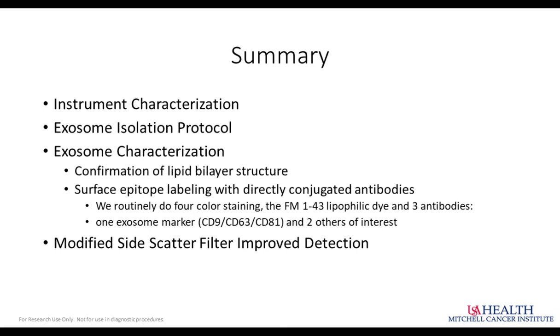It is generally accepted in the field that polystyrene does not offer a close enough true sizing standard to judge the size of an exosome. You must use the silica particles at this point. They really are the only thing available that's close enough to the refractive index to really gain a true sense of what size of particle you're resolving in your flow cytometer. And coupling that with the ultrafiltered sheath fluid really does make a huge difference in making that resolution happen.